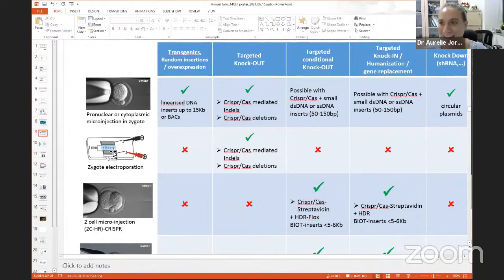The final surgery is still there. So you need to have some people in your animal facility staff who are able to do the embryo transfer. But for the genome engineering part, if you have CRISPR agents and you don't have microinjection technology in your facility, electroporation is definitely the easy way to go now. And this is what CRISPR has revolutionized a lot.